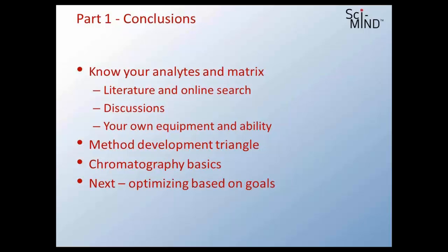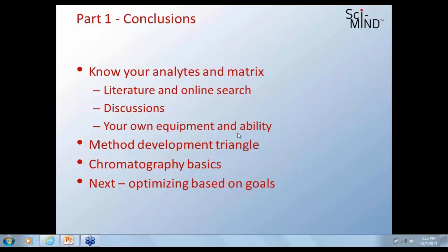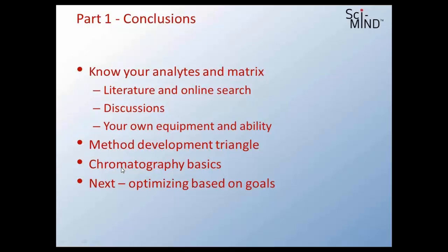I think that that's a real exciting opportunity in HPLC to get some of the best of all of the worlds. Finally, we want to think about the basics of method development. Think about your fundamental chromatography.